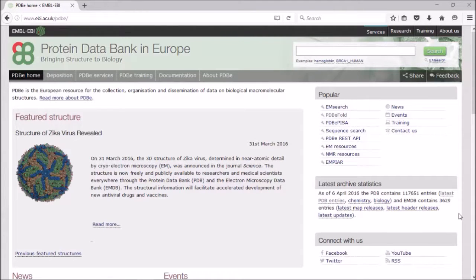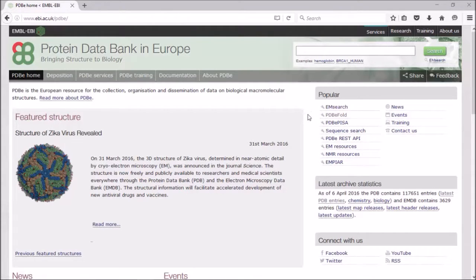If you go to our homepage at PDBe.org, at the top right here you'll see linked here for PDBe Fold, and this will take you to our Fold server.